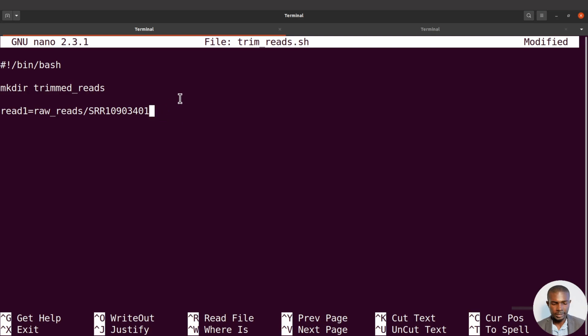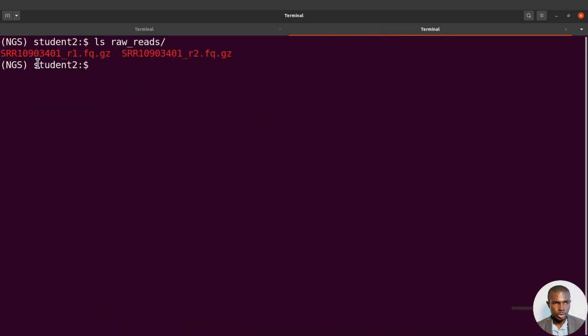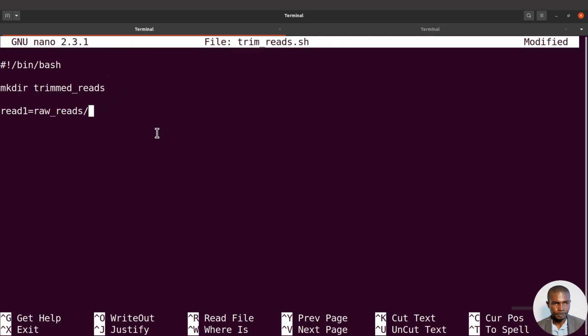It's supposed to be like this. Let me just clean it for you. So it's raw read slash this. I'll just copy and paste. That would be much easier.